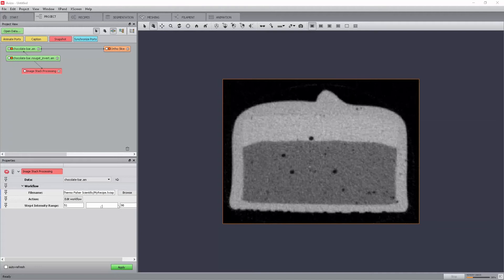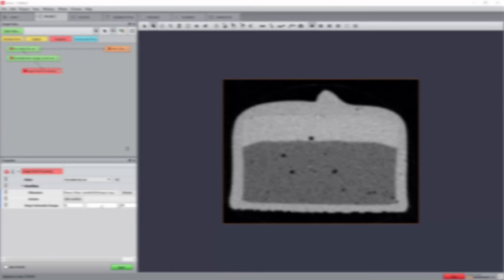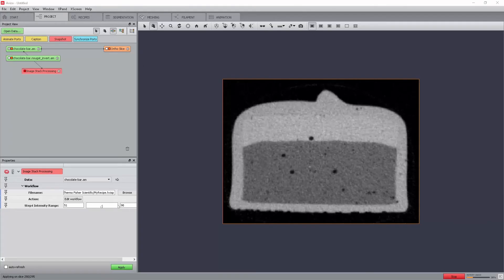To process the data with the workflow, click Apply in the properties panel once the image stack processing module has been selected in the pool. Now that the workflow is ready as an image stack processing recipe, it can be applied to any data. This can be done by changing the inputs of the image stack processing module.